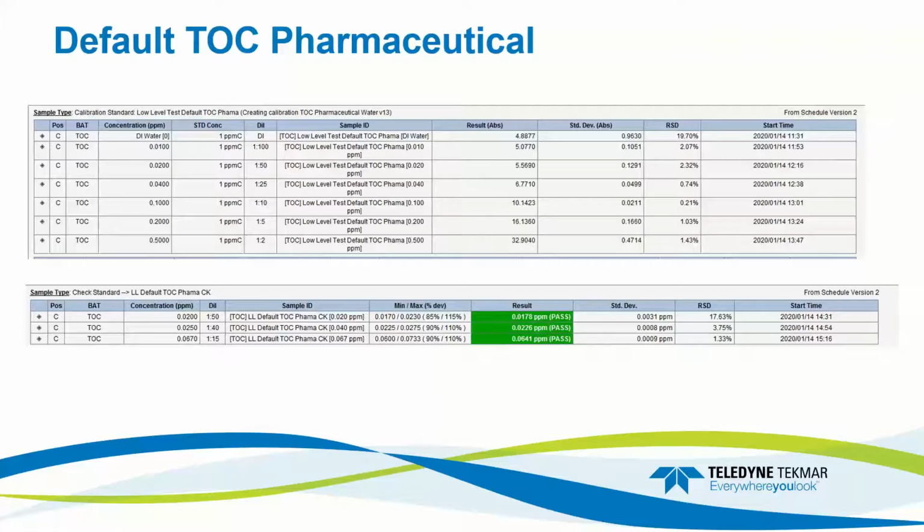It was a little bit higher than what we expected, and we can go through and look at some of the metadata to understand why. But one thing that I've understood in working with some of the scientists globally is that working at that lower level, we're going to have a bigger variance in our RSD, or sample to sample. So that could be acceptable. All depends on your laboratory SOPs.